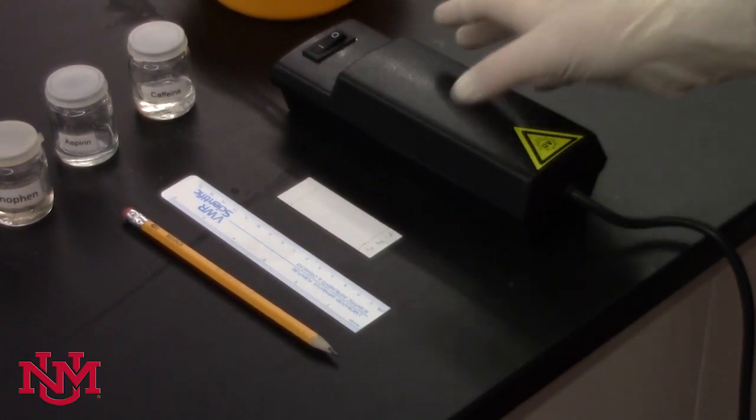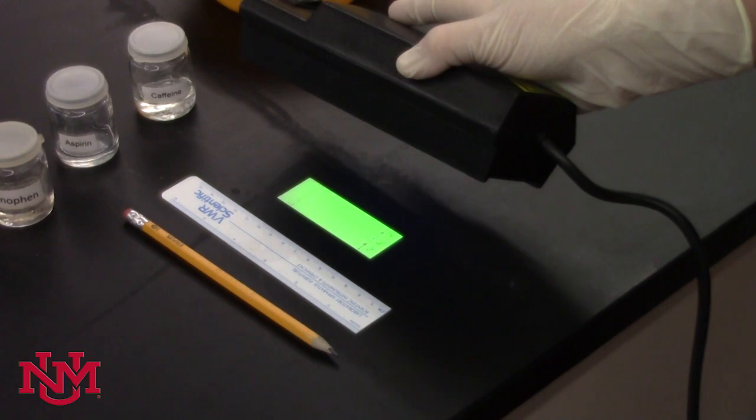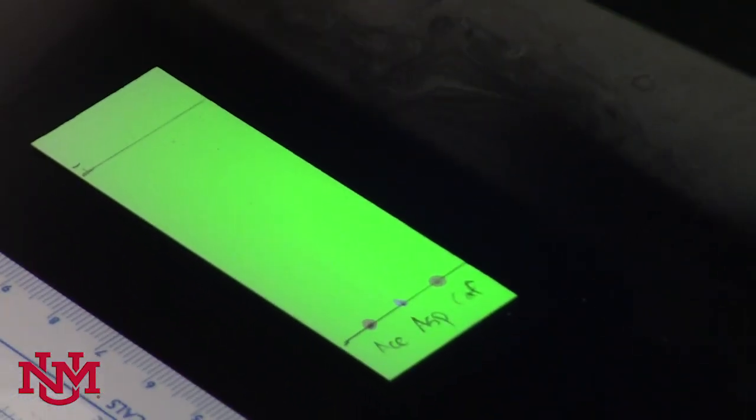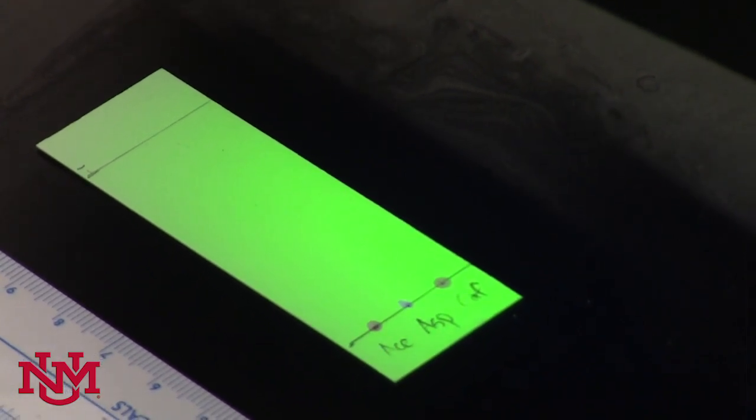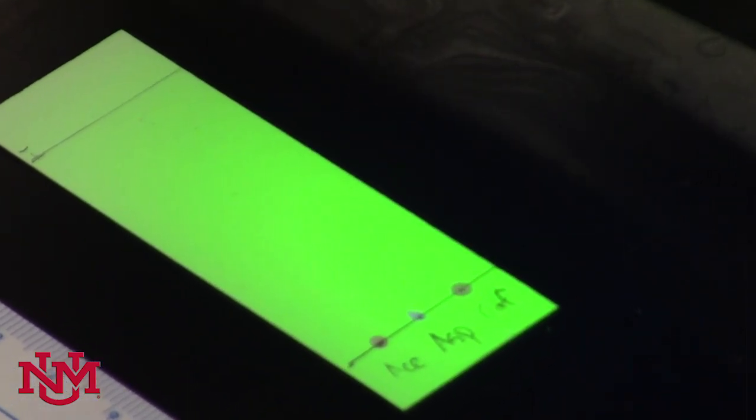If we turn it on and hold the UV lamp above the samples, you'll see that they're darker than the rest of the plate. They're actually quenching UV fluorescence, and that means since they're dark, we have successfully transferred enough sample and we can proceed with visualizing the TLC plate.